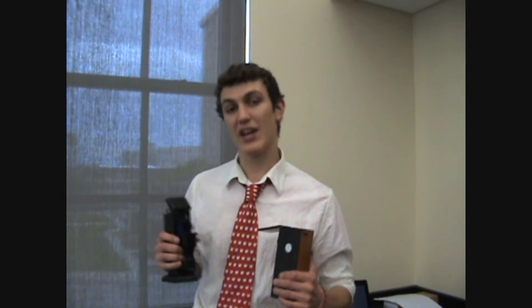The Helige wedge colorimeter. I hope you've enjoyed our talk about this today. And while it may be outdated, sure enough, it's still an accurate way to determine concentrations of solutions. And it definitely made a significant impact on certain discoveries back in its era. How about that, Wisconsin?